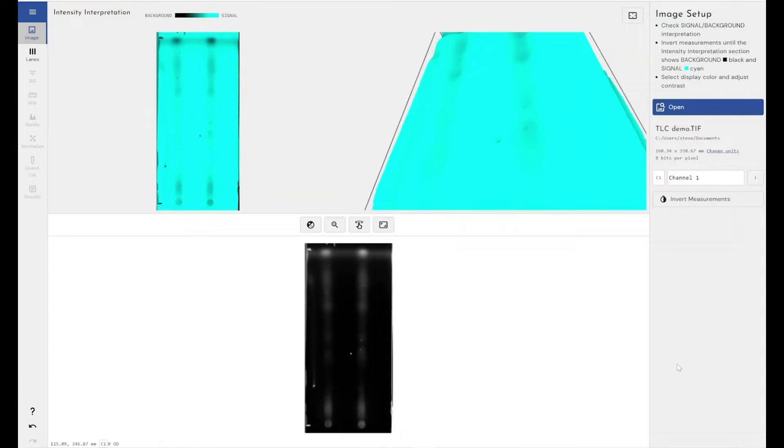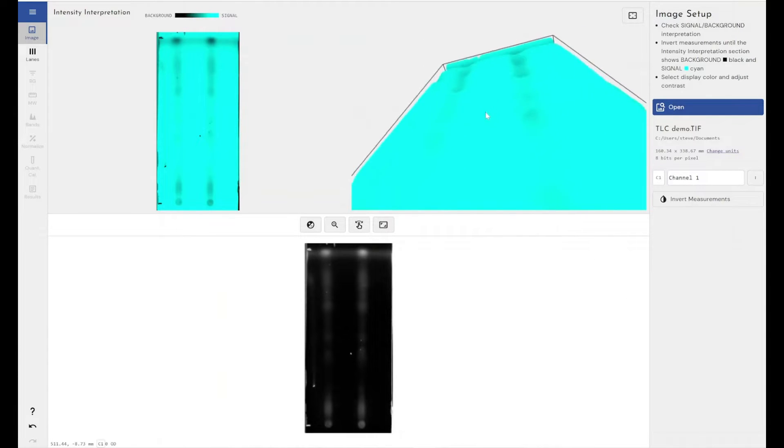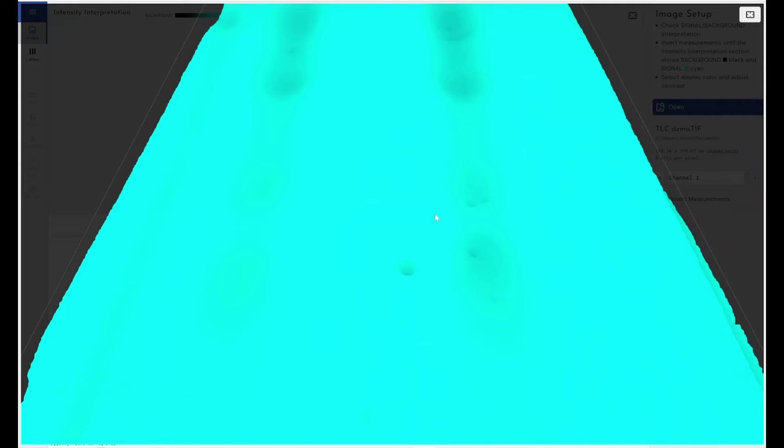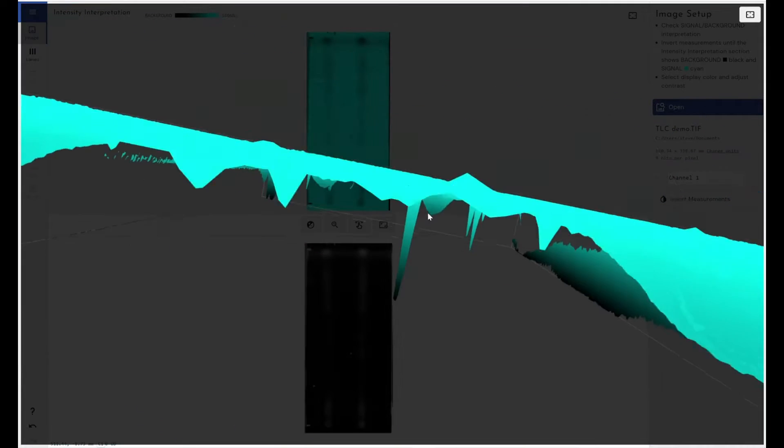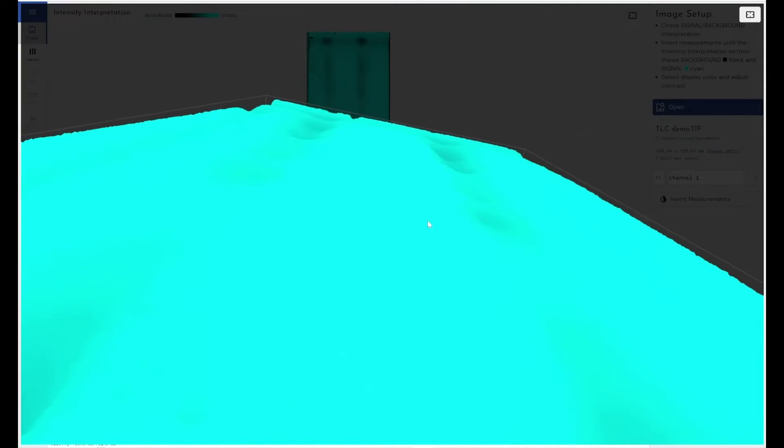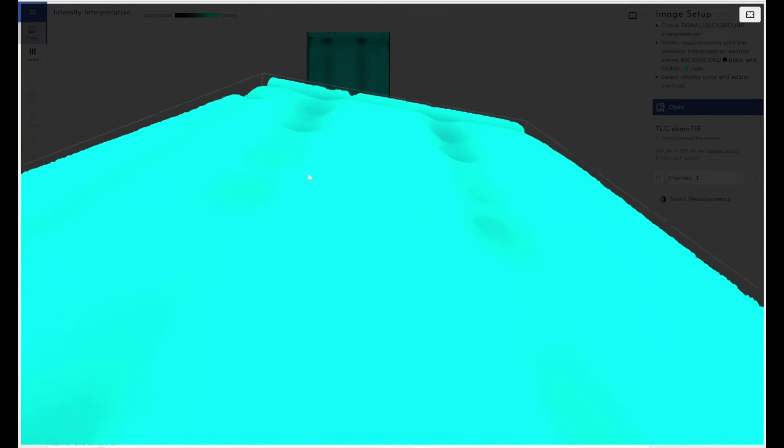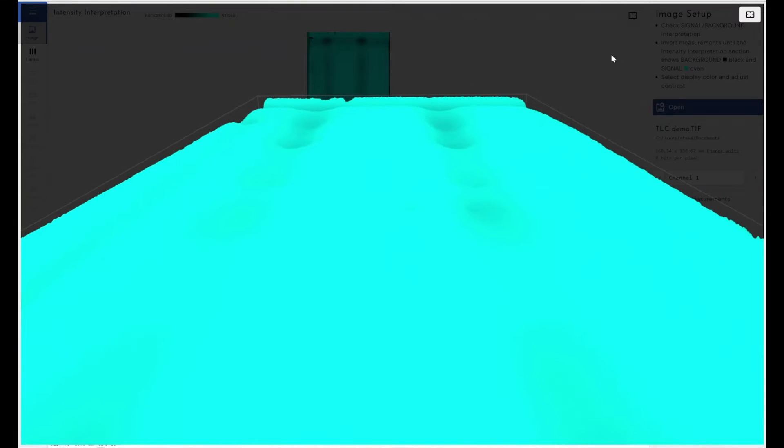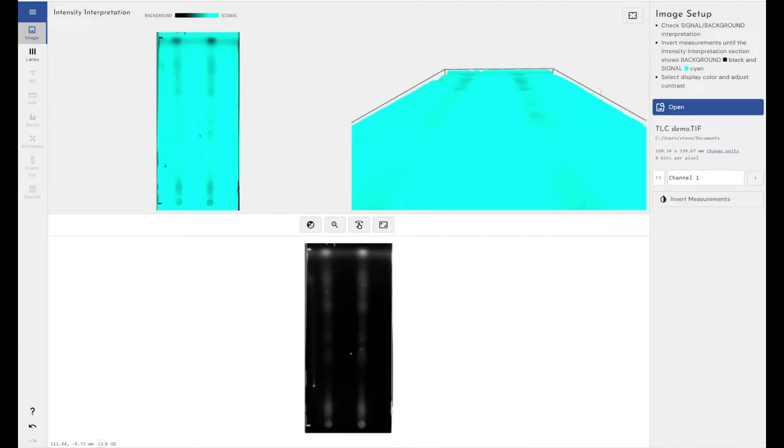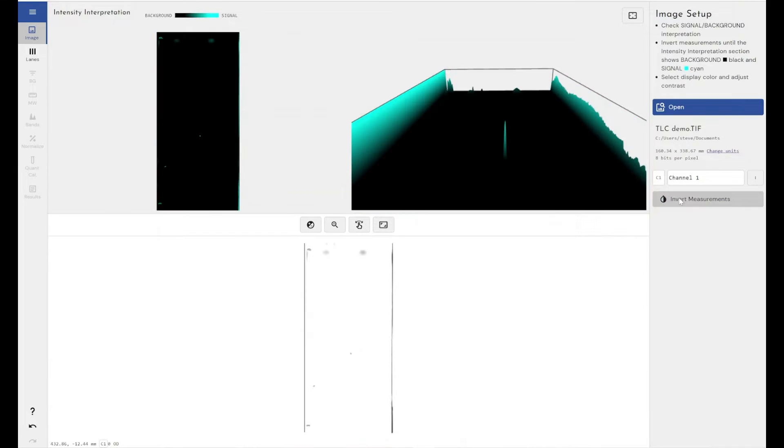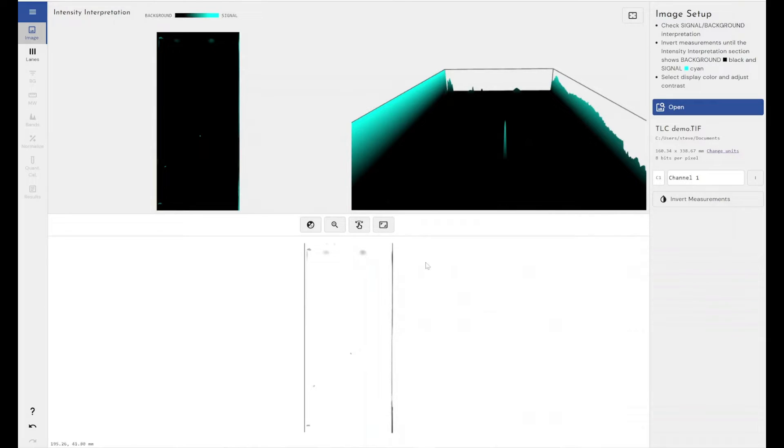So as you can see I've got an image here of a TLC slide and I've just imported it into Phoretix. The first thing I can notice is that when I've imported it I've actually got troughs instead of peaks in my 3D view. Some very faint troughs here. So this tells me that I need to invert the measurements that are coming out of that image to make them line up so the software can see peaks instead of background. So if I just come here and click on invert measurements, that's really played with the contrast of the image and now I can't see anything.